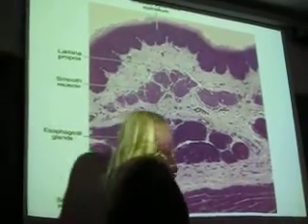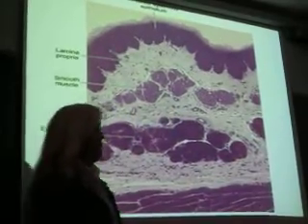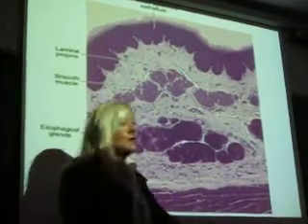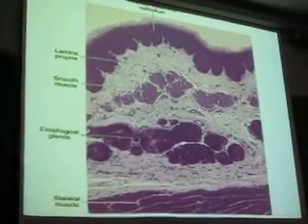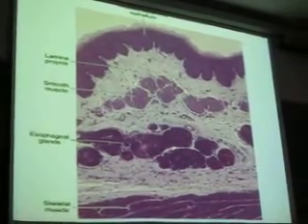Okay, so we always have a layer of muscularis externa, but what changes is that outermost layer. This is esophagus, so what layer of tissue would you expect to see here in the esophagus, the outermost layer? Adventitia, absolutely. What's adventitia made of?